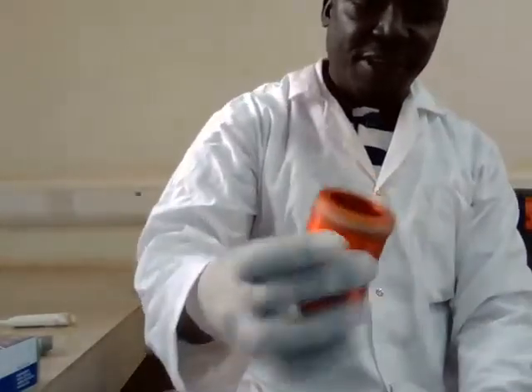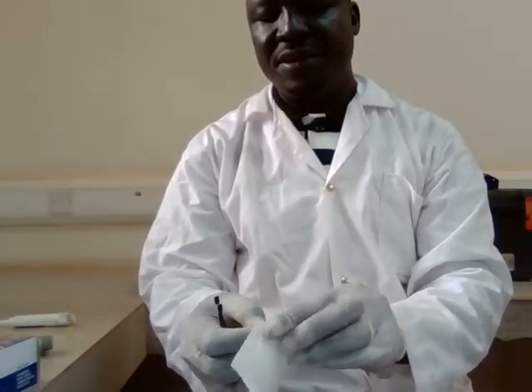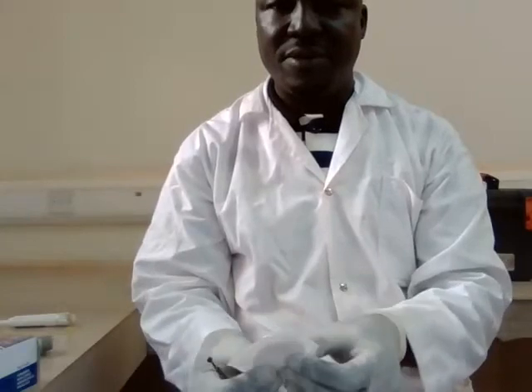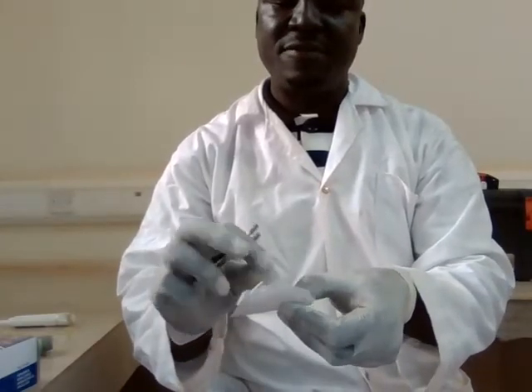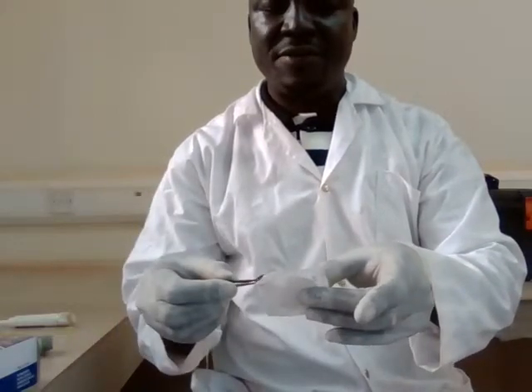And now you are going to open up this. And then also this one is sterilized. What you're going to do is open up these membrane filters carefully, without touching the surface.